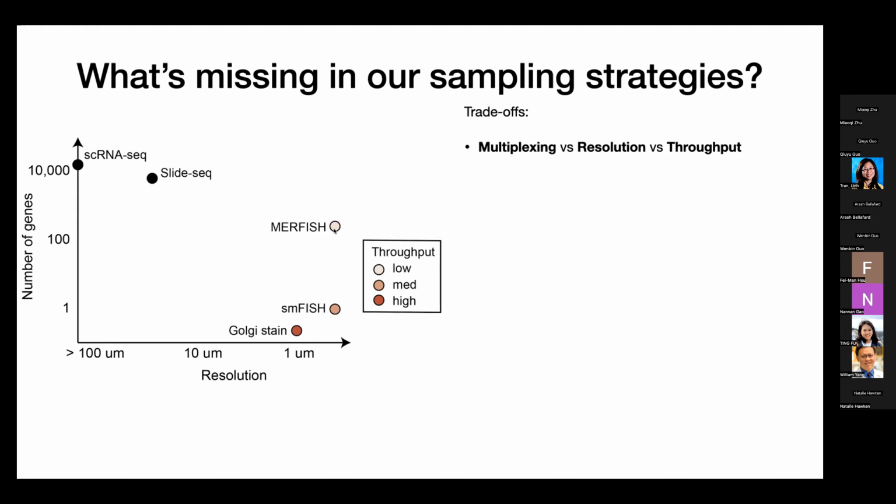But later on, MERFISH and SlideSeq, for example, try to bridge this gap, with SlideSeq capturing some spatial resolution, not at single cell level yet, but close, and MERFISH capturing over 100 different molecular species simultaneously in one tissue, with molecular resolution. But as these technologies get more complex, we still suffer from this problem of throughput, where because you measure so many genes at a time at molecular resolution, the throughput tends to be low.